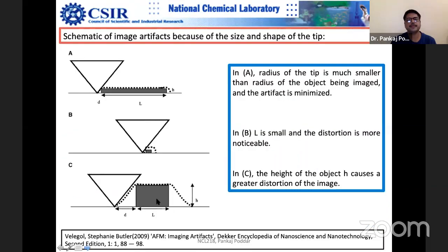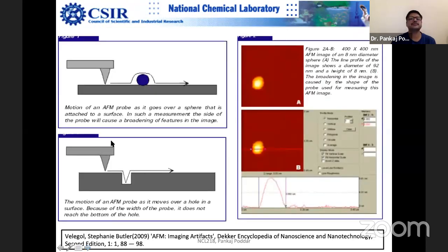One should have a rough estimate of the height of the object being measured — it should not be too large relative to the probe. Otherwise you will have a problem with the sidewall interaction. Another example: if you have a deep rectangular pit, you can see that you almost touch the bottom, but the sidewalls are not imaged rectangularly — instead you see a triangular pit. Similarly, for a spherical particle, the height is measured nicely but the lateral dimensions are broadened.